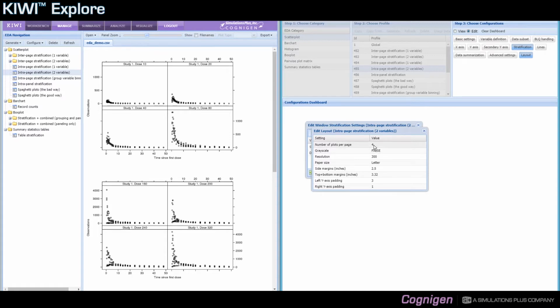If you define number of plots per page to 8, I believe you would use the entire space in a letter size, so a vertical or portrait layout. Here it's more a landscape layout with 4 plots per page.